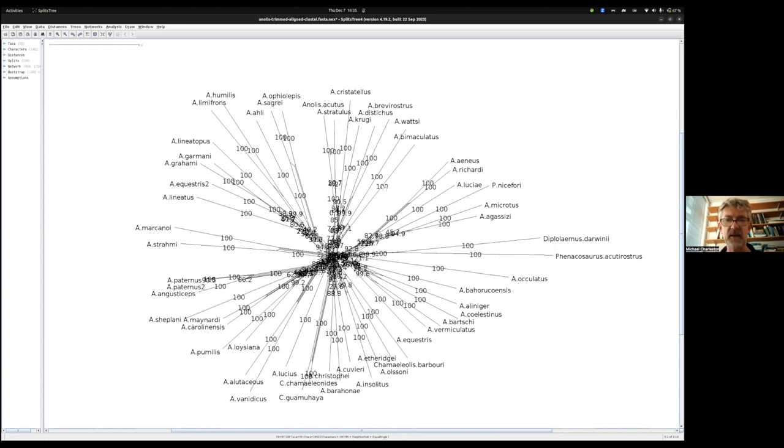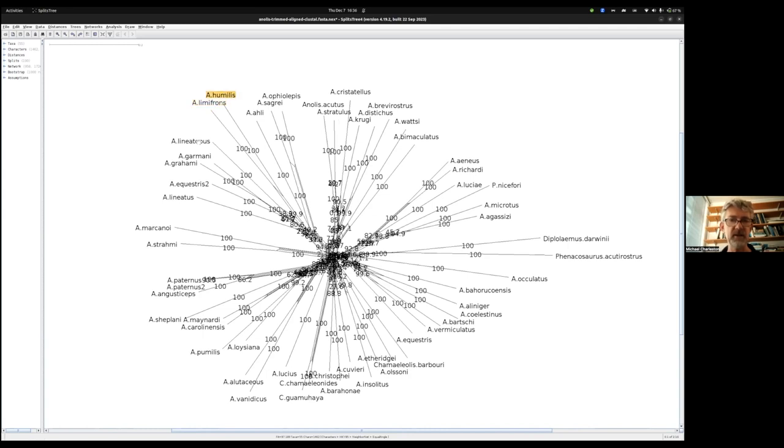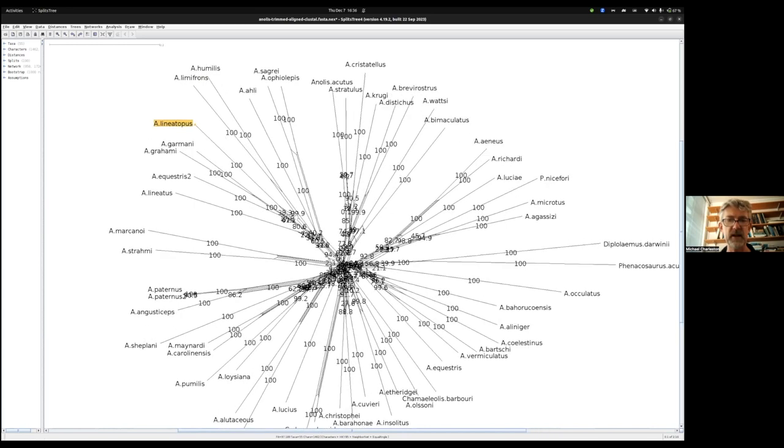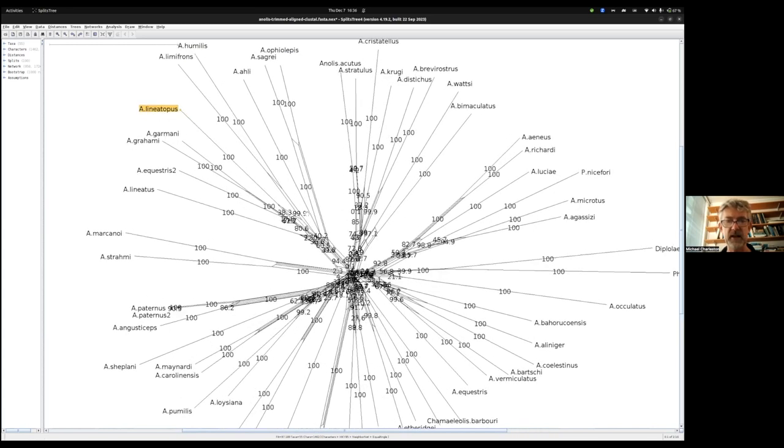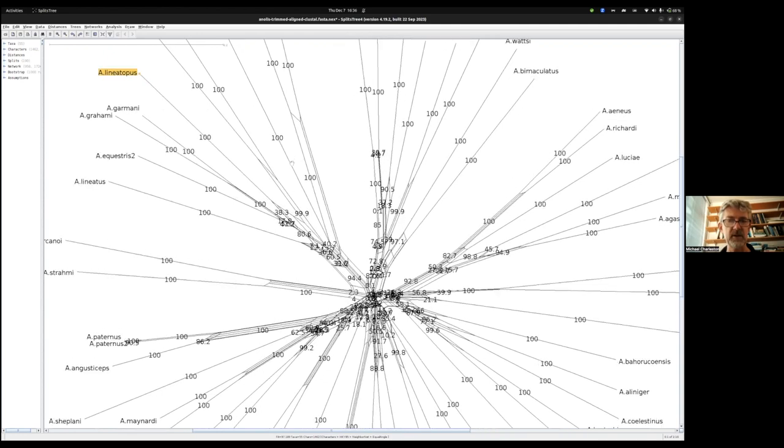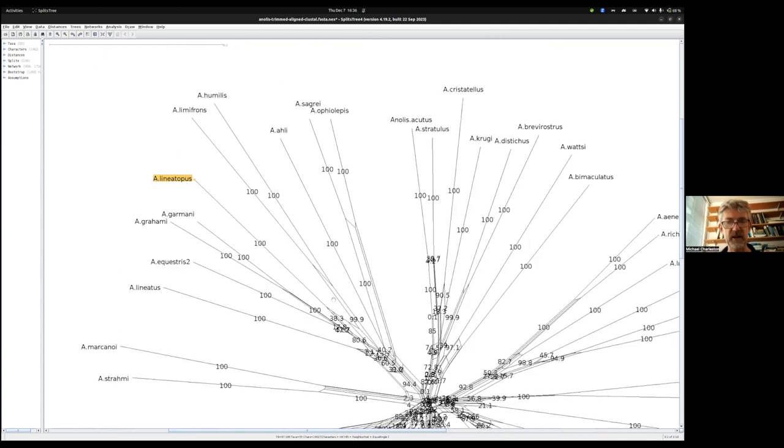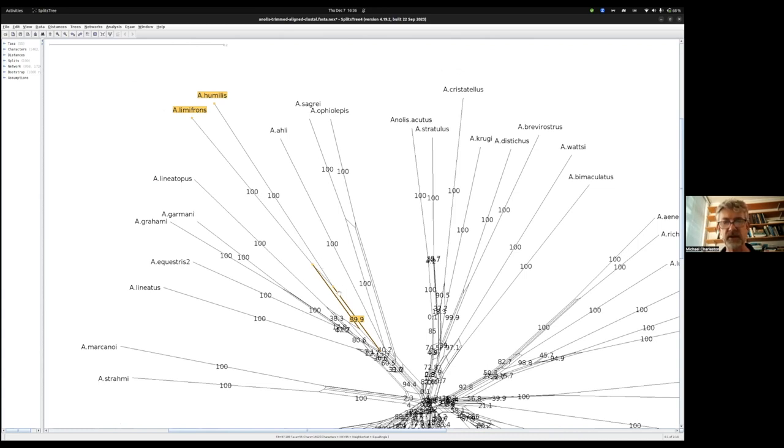We've now got numbers on each branch, including the tips. Those are all going to be 100 because they have to appear in every network. Let's look at our favorite clade. Here's limifrons, humulus, lineotopus. Let me zoom in on that clade. I can see that in 99.9% of my 1000 replicates, so in all but one, this split occurred that had limifrons and humulus together.